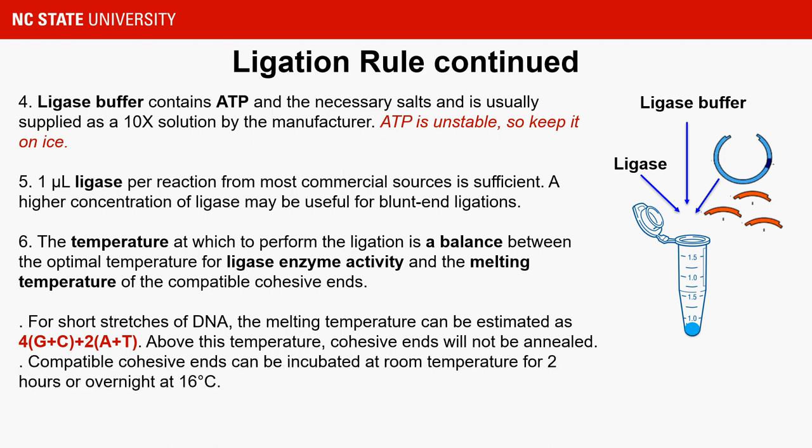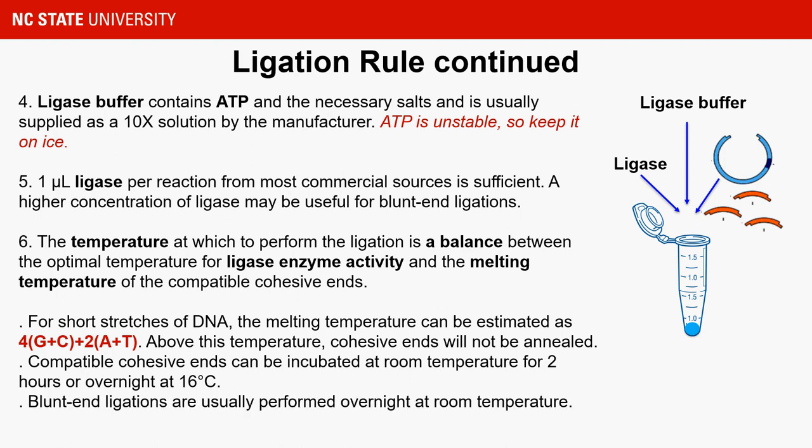Usually, for compatible cohesive ends, the ligation reaction is incubated at room temperature for 2 hours or overnight at 16 degrees Celsius. For blunt end reactions, the ligation is incubated overnight at room temperature.